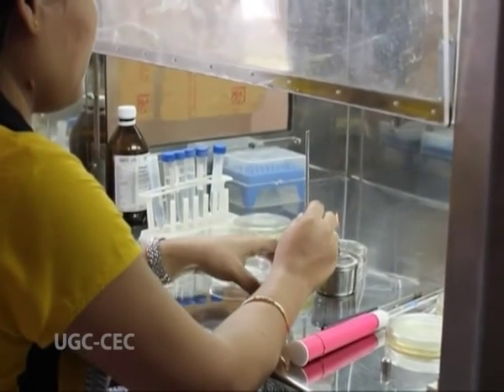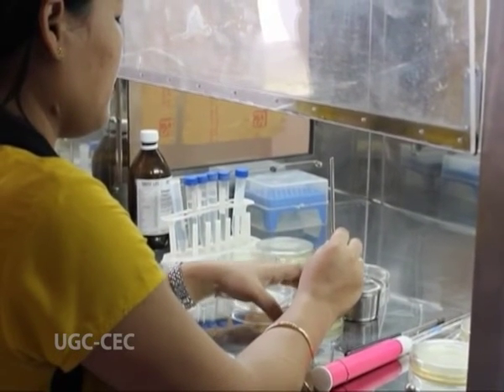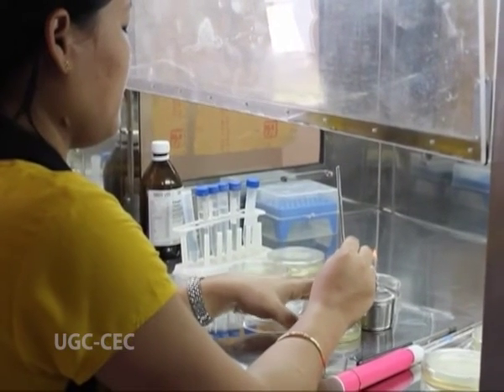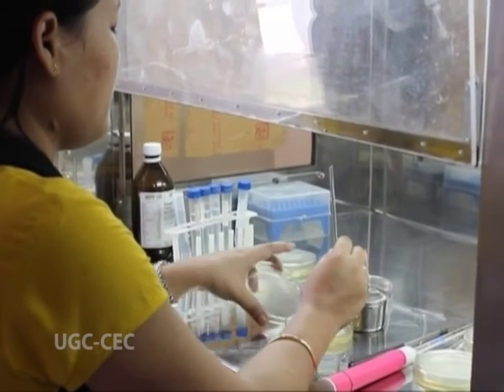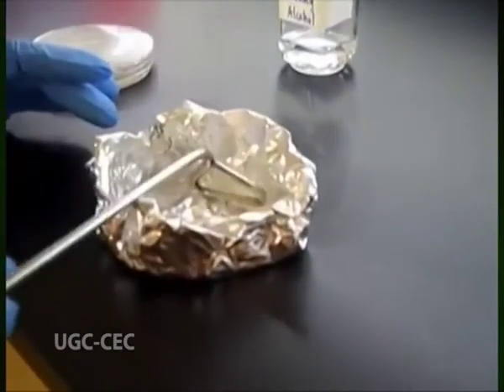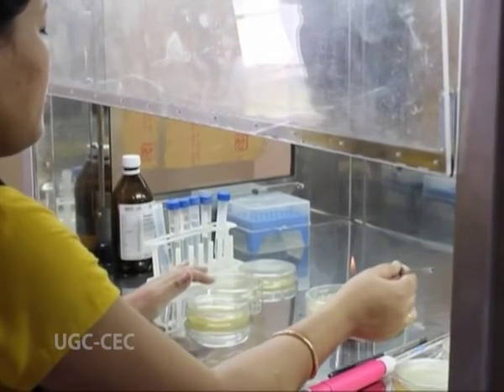Further, aseptically, a loopful of the culture is transferred onto the appropriately labeled nutrient agar plates. Then the glass rod is removed from the beaker and placed on the petri plate. The glass rod is gently pressed and rotated back and forth for spreading the culture over the agar surface. Then the glass rod is immersed in the alcohol again and reflamed to sterilize it.